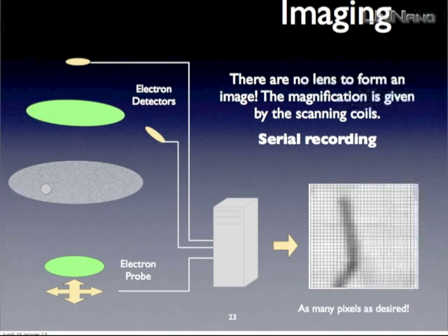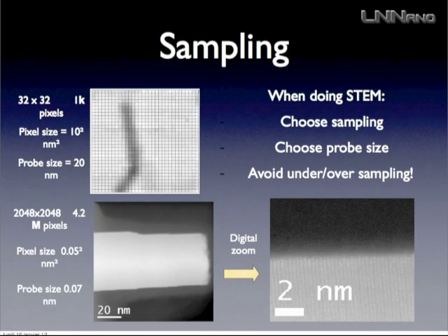So this is the strength of the technique. It's not very good if you want to be very fast, and it's less and less true with the advent of aberration-corrected machines, which I will describe tomorrow. But in fact, it's not the best technique in a non-aberration-corrected machine to make high-resolution images. But it's a very good machine to make images where you need sensitivity.